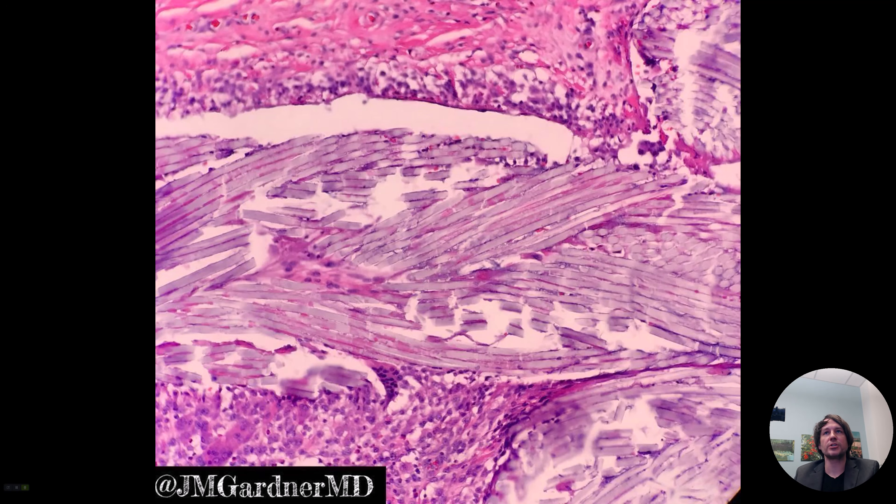Hi, I'm Dr. Jared Gardner and I just wanted to share a fun incidental finding that's pretty to look at.